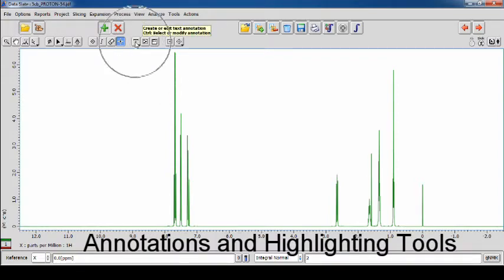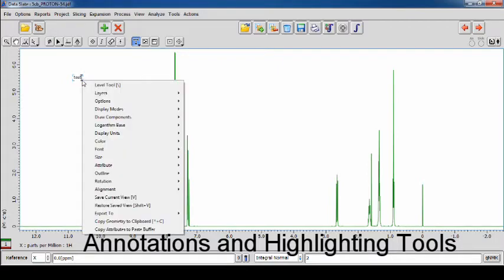Create Annotation allows you to add annotations to the data. Click any area in the geometry and then type the message you want. The text of the annotation can be modified by holding the right mouse button. When the menu shows, you can edit the color, font, and size of the text, as well as rotate the text, align the text, or give the text an outline.